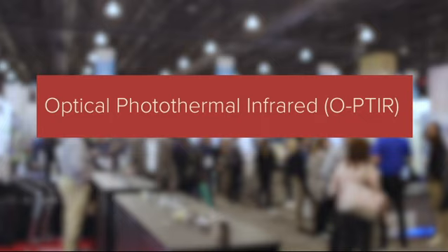Optical Photothermal Infrared, O-PTIR, is the acronym that we like to go by. It's a new and alternative way of doing infrared spectroscopy. Infrared spectroscopy has been around for probably 100 years. It's been done dispersively, it's been done with FTIR, and your audience would be certainly familiar with FTIR. There's also these emerging QCL-based imaging techniques.